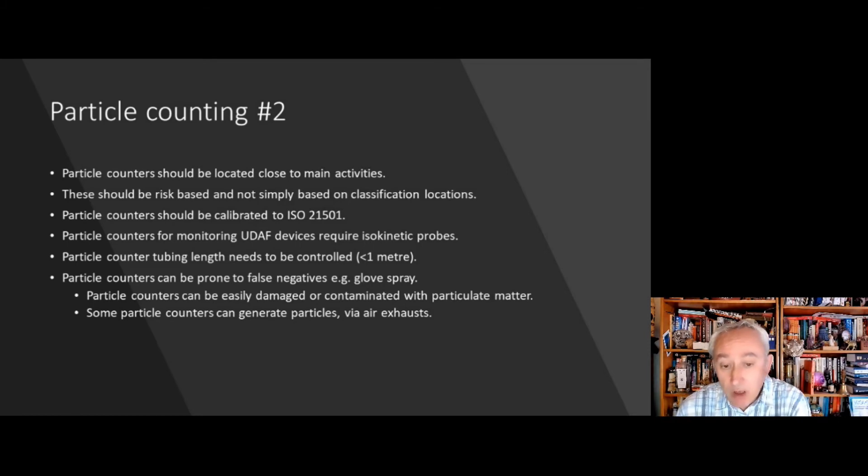Where we're monitoring particles within unidirectional airflow devices, these counters should be fitted with isokinetic probes. These are the stainless steel contraptions that go on the end of the particle counter tubing and help to straighten the air and make sure the air is going through the counter with a uniform velocity. These probes should always be orientated in the direction of the airflow.